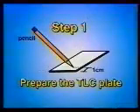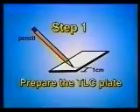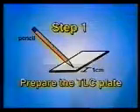For TLC, as the name suggests, the adsorbent is supported as a thin coating on a flat surface such as aluminum, glass, or plastic. Remember to always use pencil when marking a TLC plate. Mark a light pencil line about 1 centimeter from one edge, the bottom of the plate. Touching the plate lightly to hold it in place, mark ticks on the line about 1 centimeter apart to indicate where the sample will be spotted.